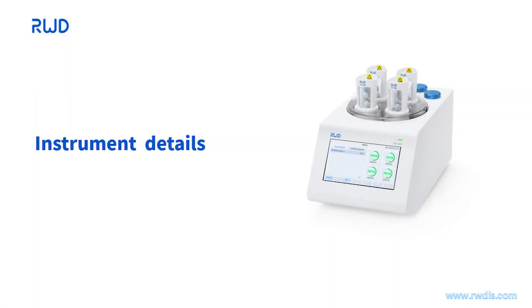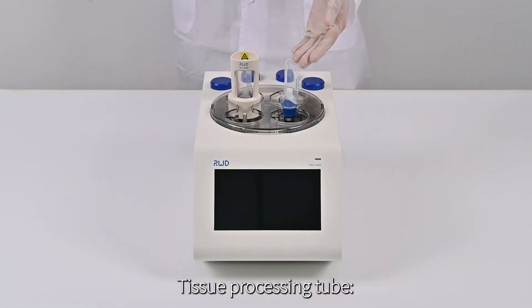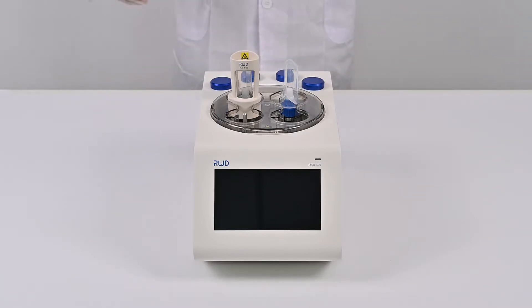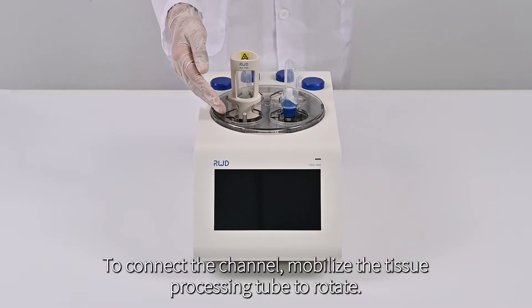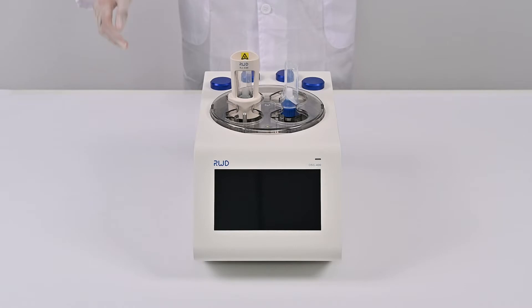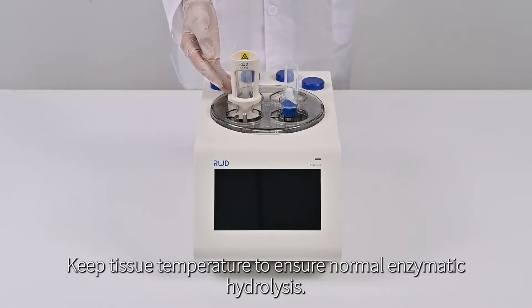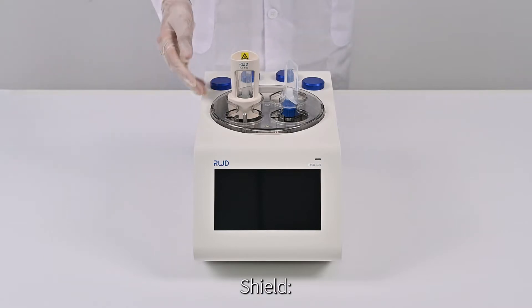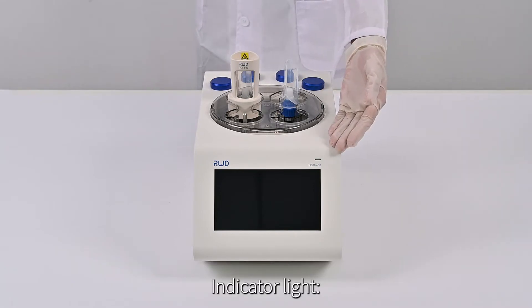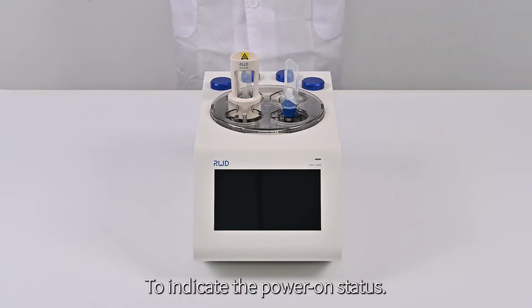Instrument Details. Tissue Processing Tube: for holding sample tissue and processed single cell suspensions or homogenates. Bushing: to connect the channel and mobilize the Tissue Processing Tube for rotation. Heating Jacket: keeps tissue temperature to ensure normal enzymatic hydrolysis. Shield: to prevent suspension splash and protect the safety of the experimenter. Indicator Light: indicates power-on status.